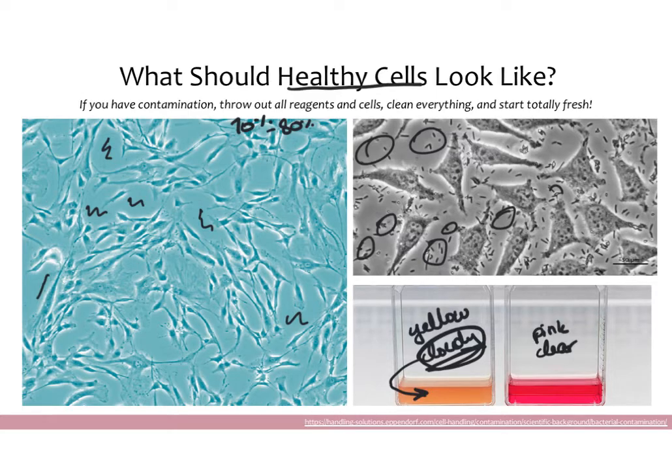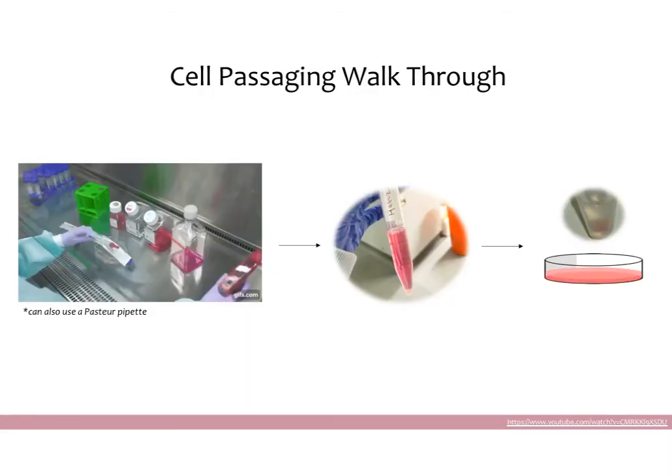Contamination is something you always want to check for, especially when you're starting out, because it's fairly common and can happen to anyone. So be consistently careful and check everything very carefully every day. Once you've heated your media and checked your cells for contamination, you're basically ready to passage. Here you can see what a hood typically looks like — there's a glass panel at the front, and the researcher is doing all her work with gloves inside the hood. She opened this pipette inside the hood and all her reagents are capped, having not been opened until inside the hood.